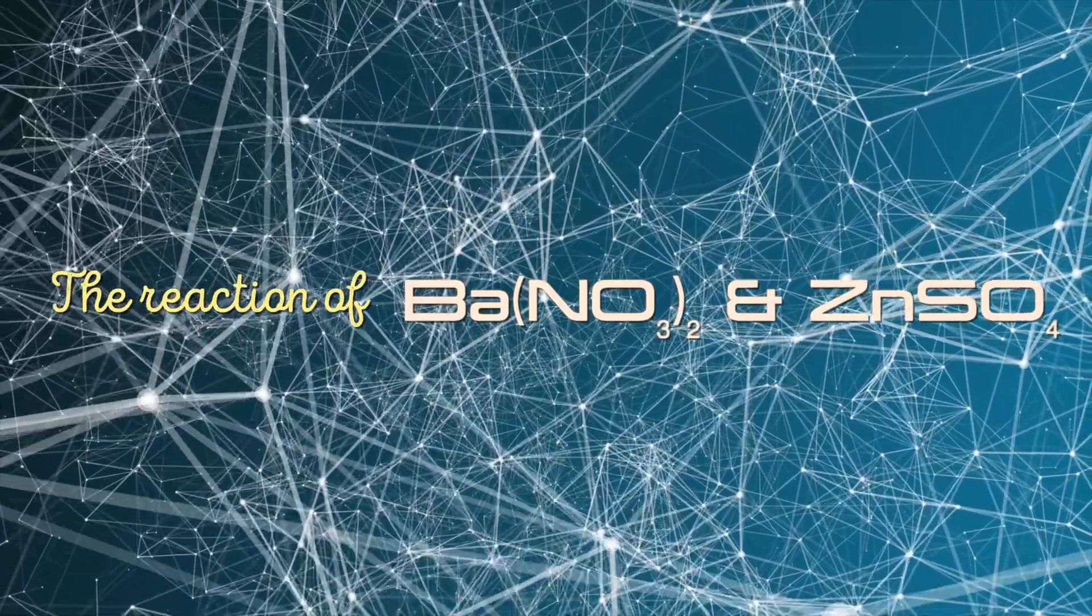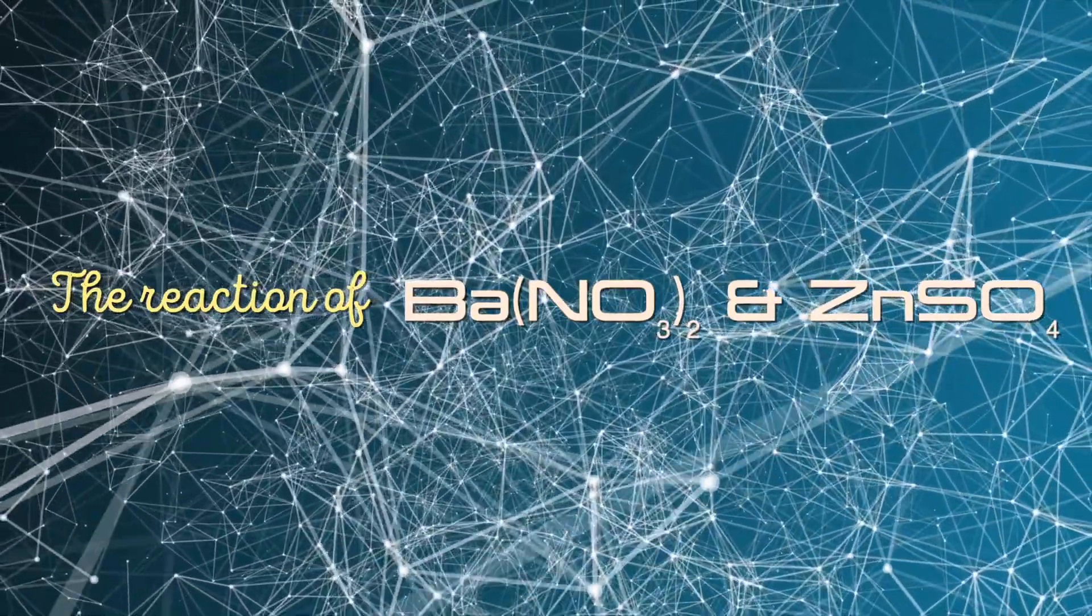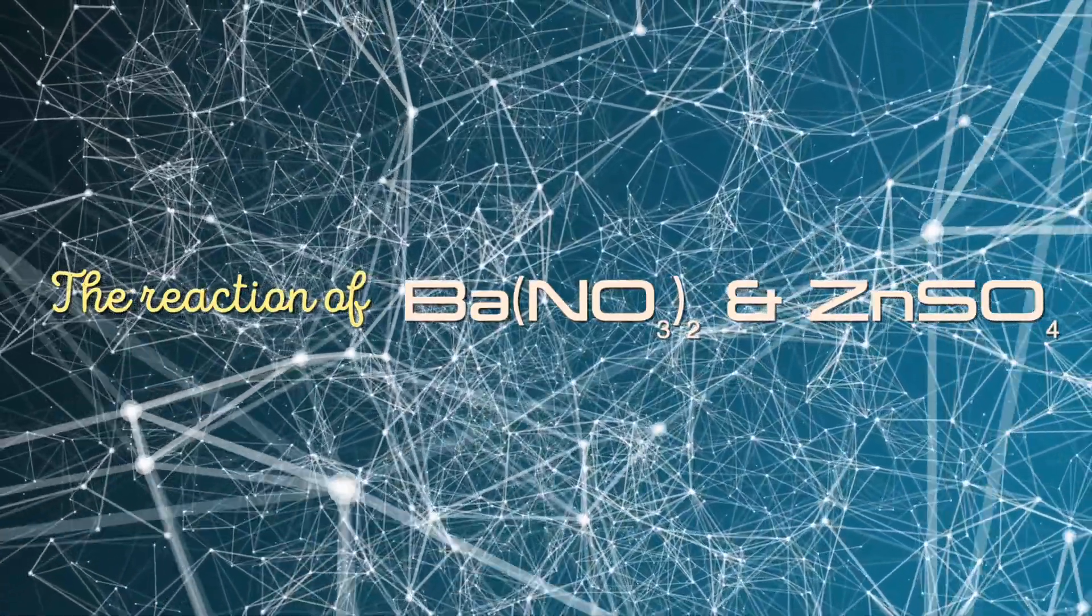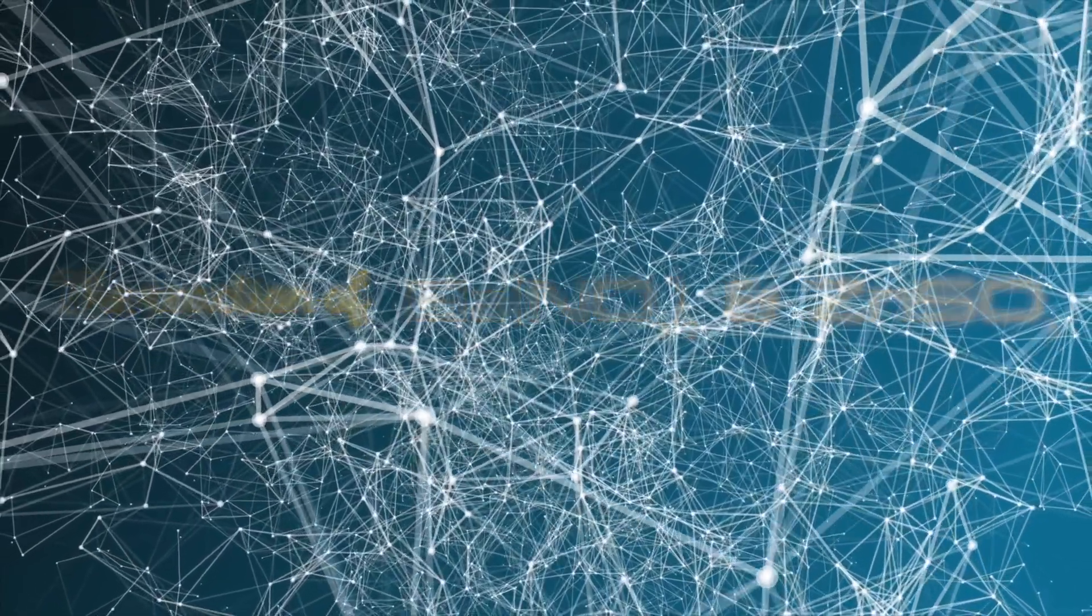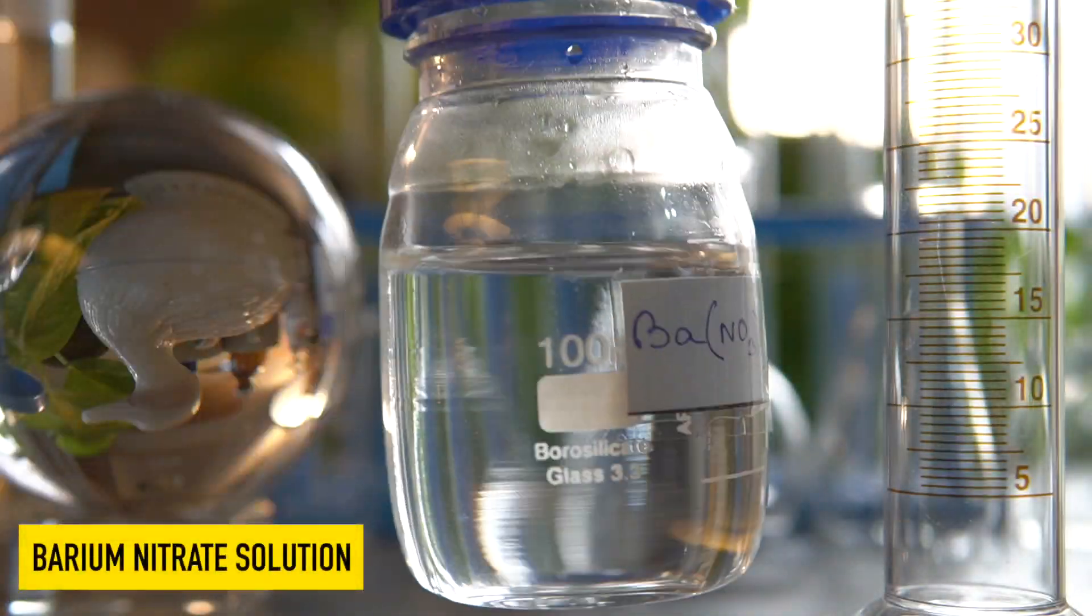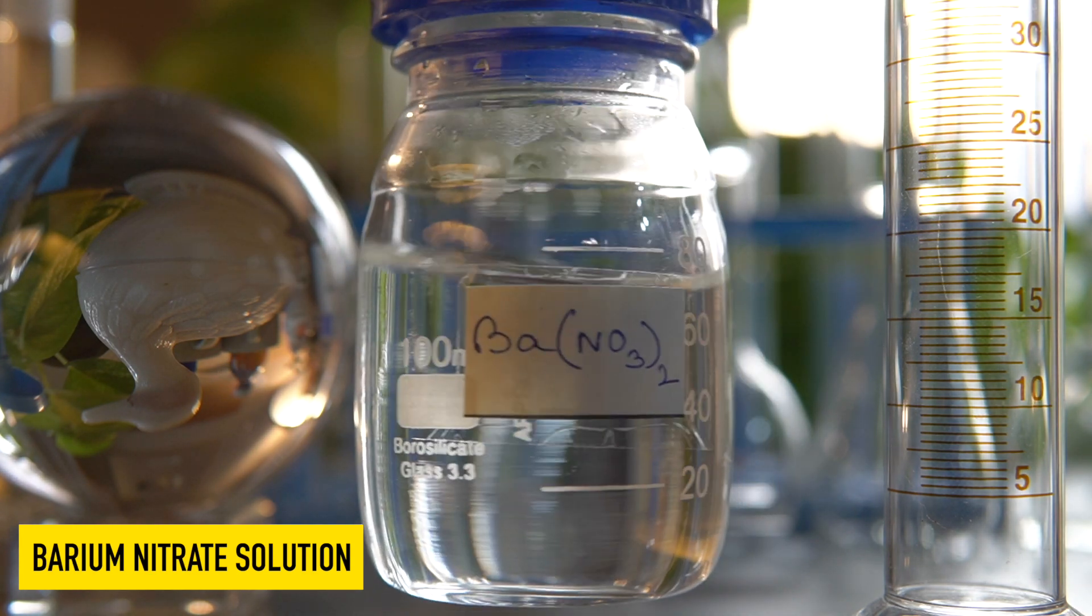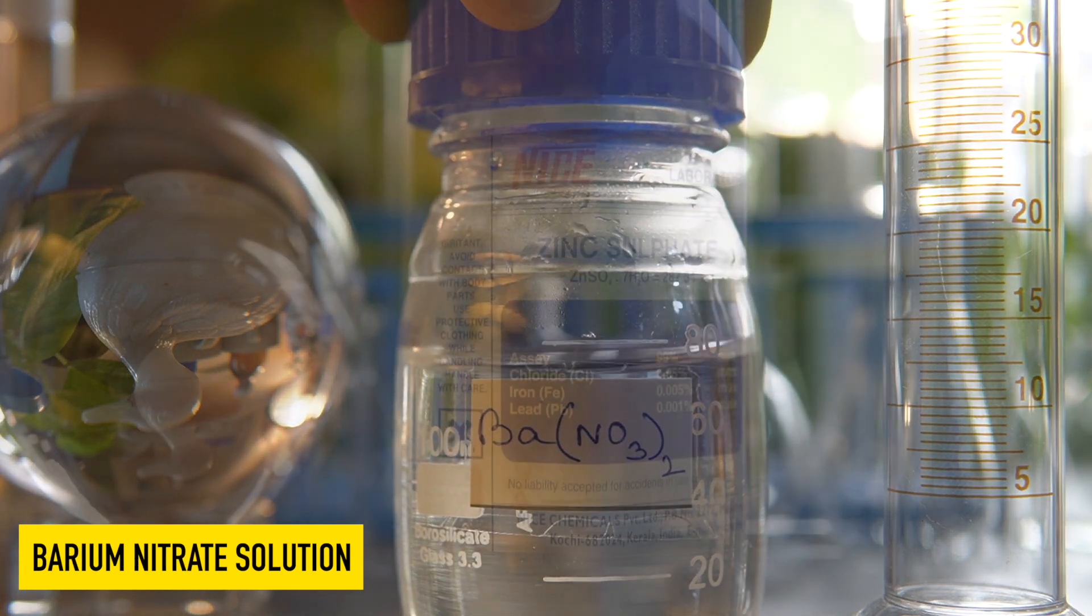Today we are going to observe a chemical reaction between barium nitrate and zinc sulfate. For this reaction we will take a clear solution of barium nitrate.